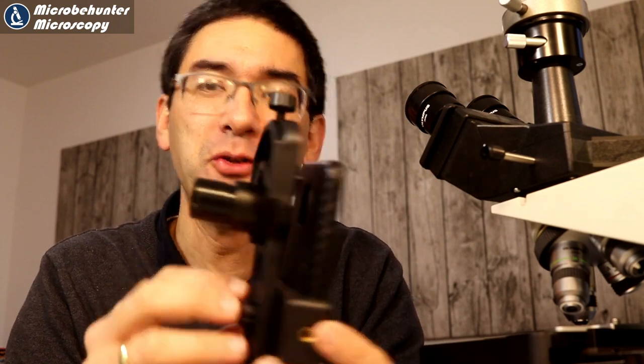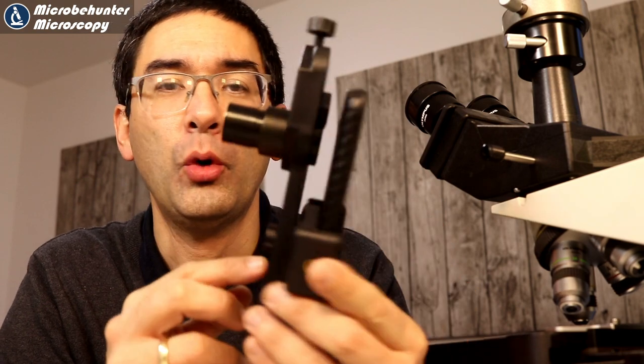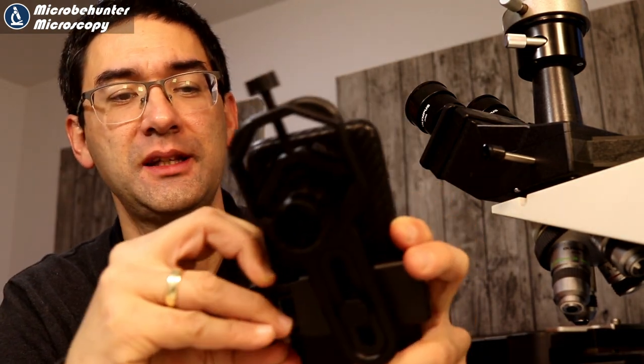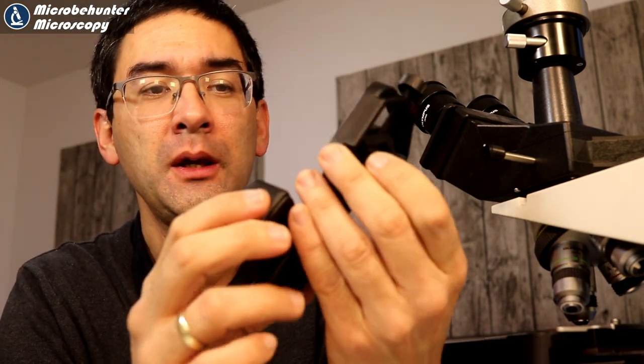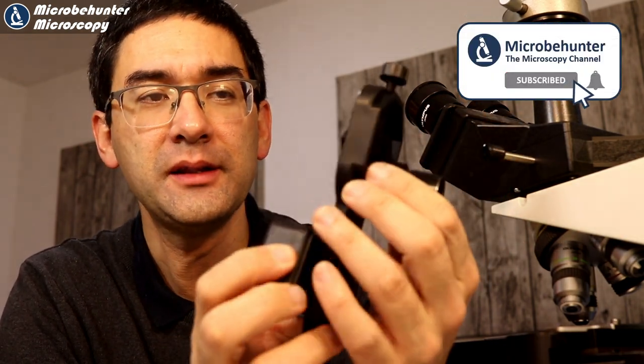Hi, MicroPuncher here and today I want to do another product review. I recently bought myself this mobile phone adapter. I think I'm just going to remove the mobile phone so that you can see it better. It looks like this. Of course the eyepiece was not included here and I want to basically give you a more in-depth look at this adapter.